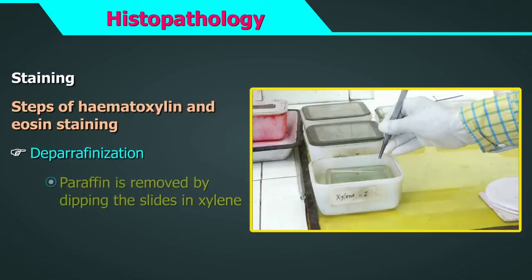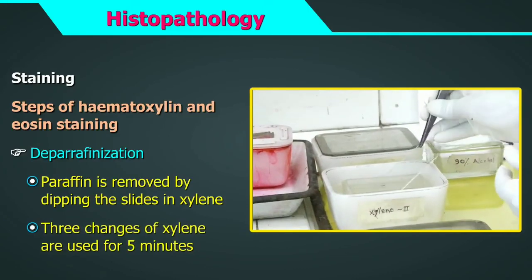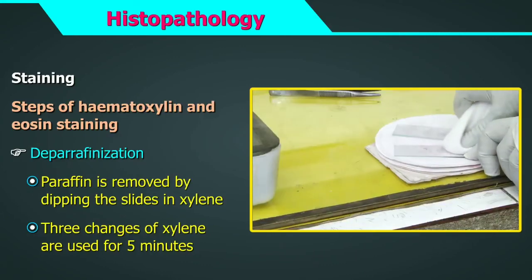Deparaffinization. Paraffin is removed by dipping the slides in xylene. 3 changes of xylene are used for 5 minutes each, with gentle wiping of the back of the slide and around the tissue section after each change.